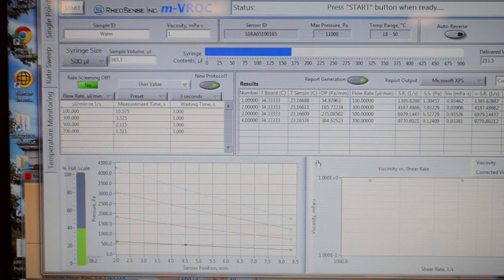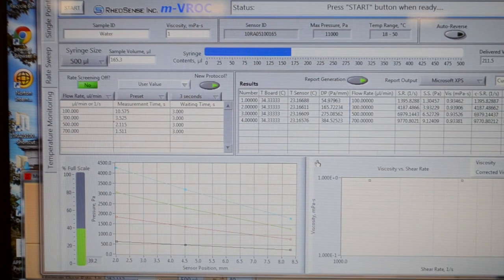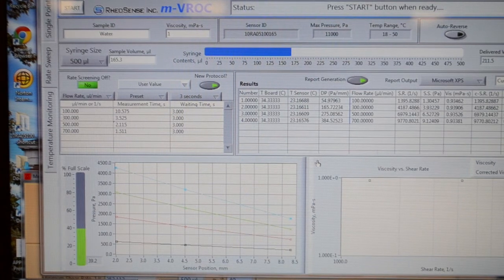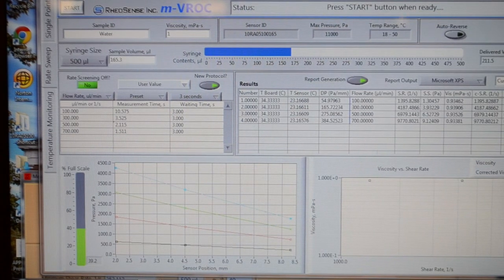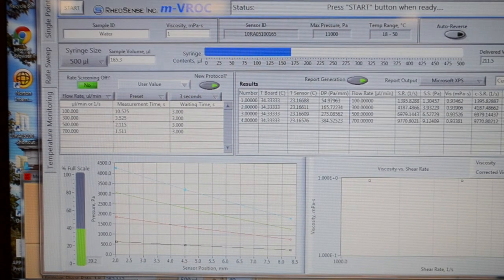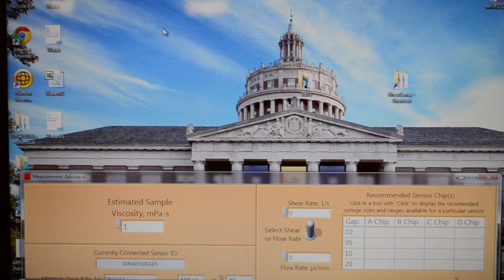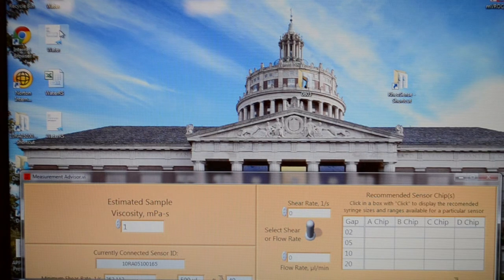We may proceed to step 6, data interpretation. I'll minimize the MBROC control program and open the reports for both single point and rate sweep.